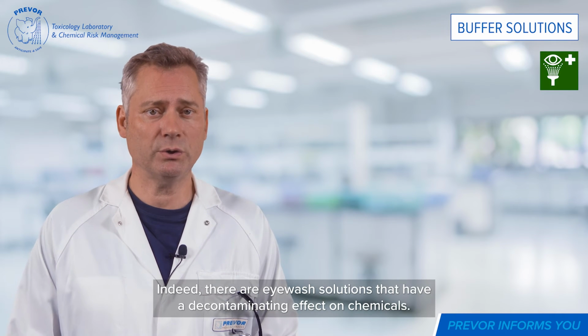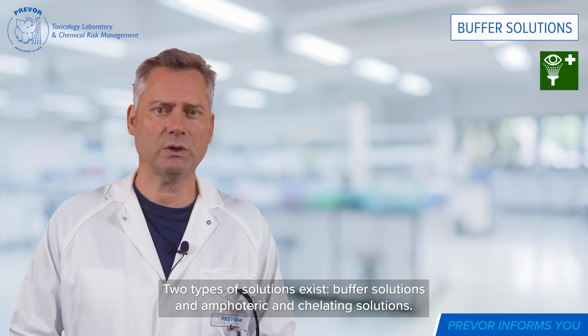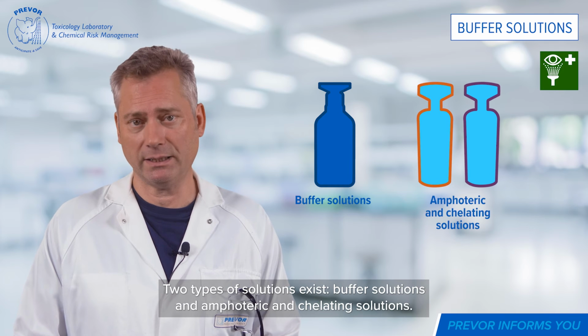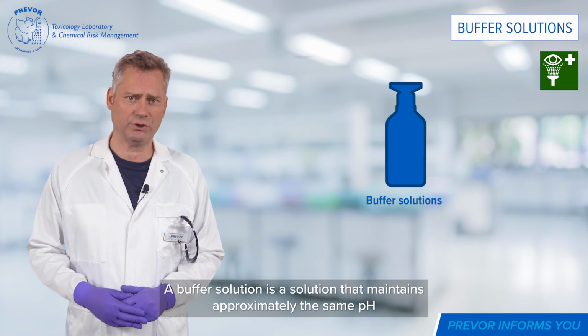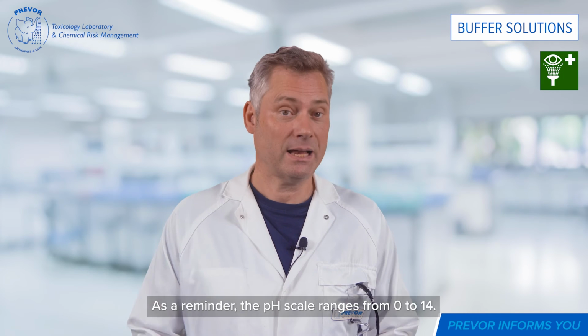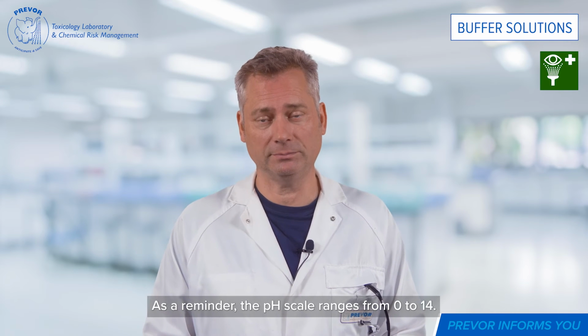Indeed, there are eye wash solutions that have a decontaminating effect on chemicals. Two types of solutions exist: buffer solutions and amphoteric and chelating solutions. A buffer solution is a solution that maintains approximately the same pH despite the addition of small amounts of an acid or base. As a reminder, the pH scale ranges from 0 to 14.